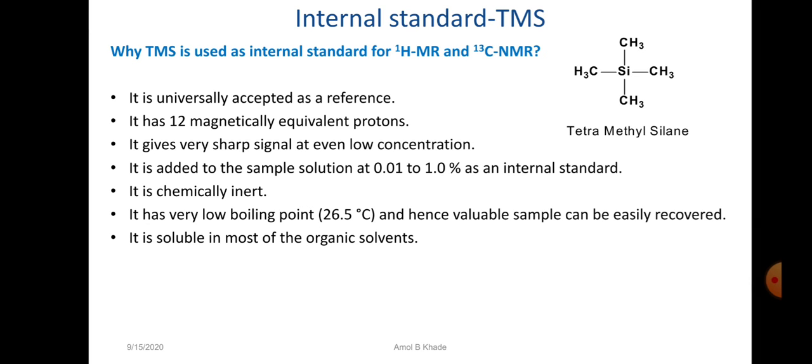These are very important points, and very frequently asked in examinations. TMS is used as an internal standard because it is universally accepted as a standard or reference. Then TMS has 12 magnetically equivalent protons. So we can see this CH3, this CH3, all these protons are in the same chemical as well as magnetic environment.